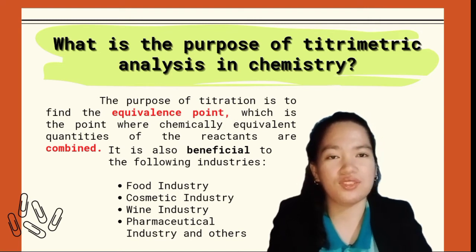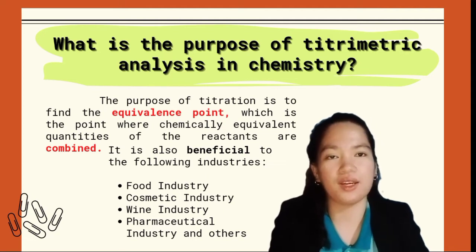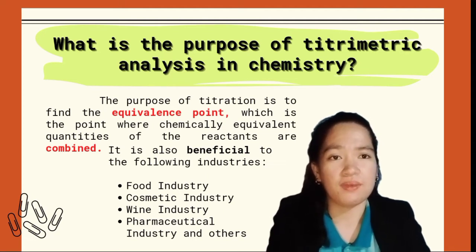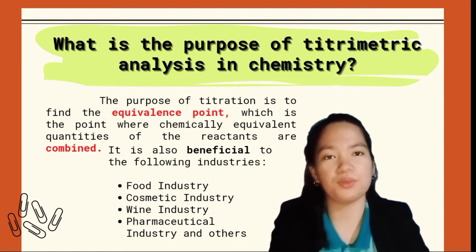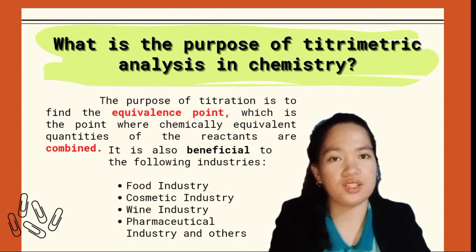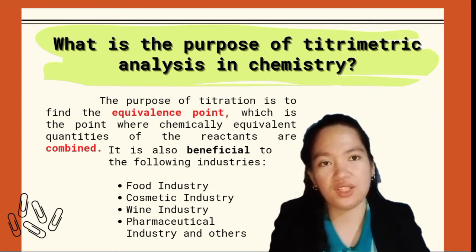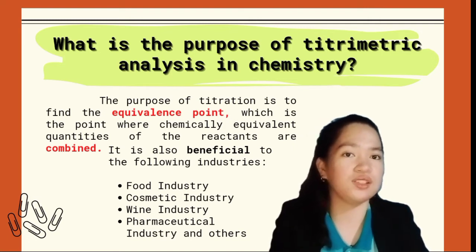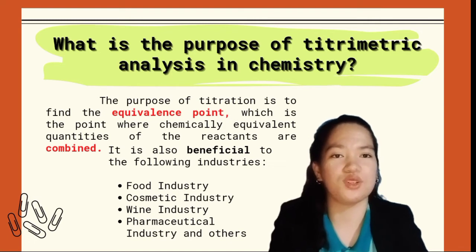Nowadays, due to the increase in demand, the classical method of titration in the industrial sector has been replaced by auto-titrators, machines that progressively feed in the titrant and measure whatever property is used to determine the endpoint. Nonetheless, manual titration still proves very useful where the cost or need for automation is not justified. For instance, titration in the chemistry laboratory serves as a bridge between several theoretical concepts and practical operations for students pursuing chemical sciences or engineering.